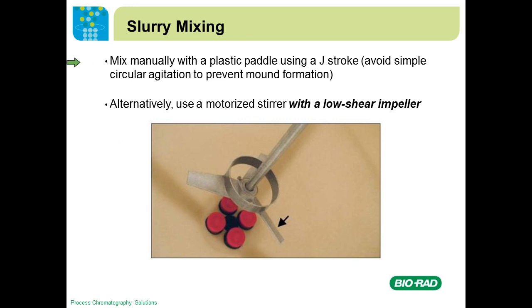For mixing the slurry, either mix manually with a plastic paddle using a J-stroke, or use a motorized stirrer. Avoid simple circular agitation, because this creates a mound of CHT at the bottom — similar to stirring undissolved salt in a glass. If you use a motorized stirrer, make sure you have a low shear impeller, such as a hydrofoil impeller. CHT particles, while withstanding a lot of pressure, are vulnerable to shear. A high shear impeller will damage particles and result in a column that is very hard to flow.